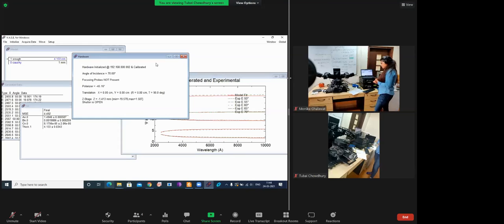Okay, this is okay. Now we'll go for practical samples. Till now, does anybody have any question regarding the glass substrate? I'm repeating the same thing: due to this lockdown and everything, we do not have smooth glass substrates. That's why we have just taken the simple glass substrate we have in our lab, so they are not optically smooth. If you have an optically smooth glass substrate, it will show very good peaks.